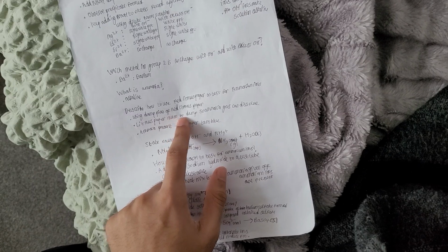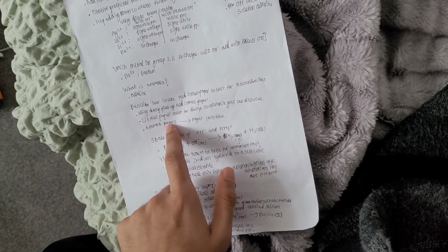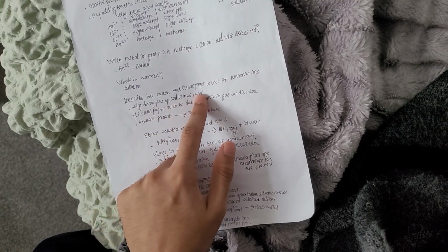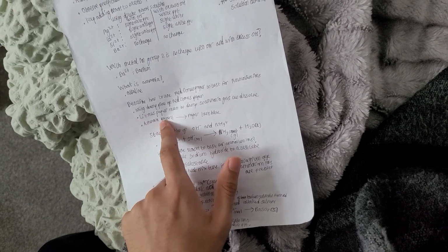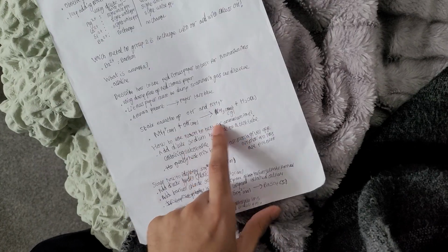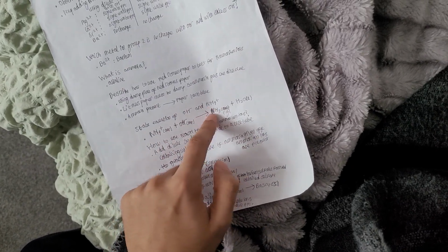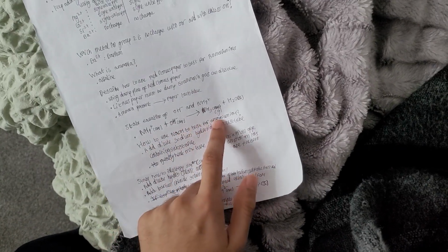The litmus paper must be damp so that ammonia gas can dissolve. And if ammonia is present, the paper will turn blue. So, using a damp piece of red litmus paper, the litmus paper must be damp so ammonia can dissolve. If ammonia is present, the paper turns blue. Say the equation: NH4+ aqueous plus OH- aqueous forms NH3 gas, ammonia, plus H2O liquid, water.